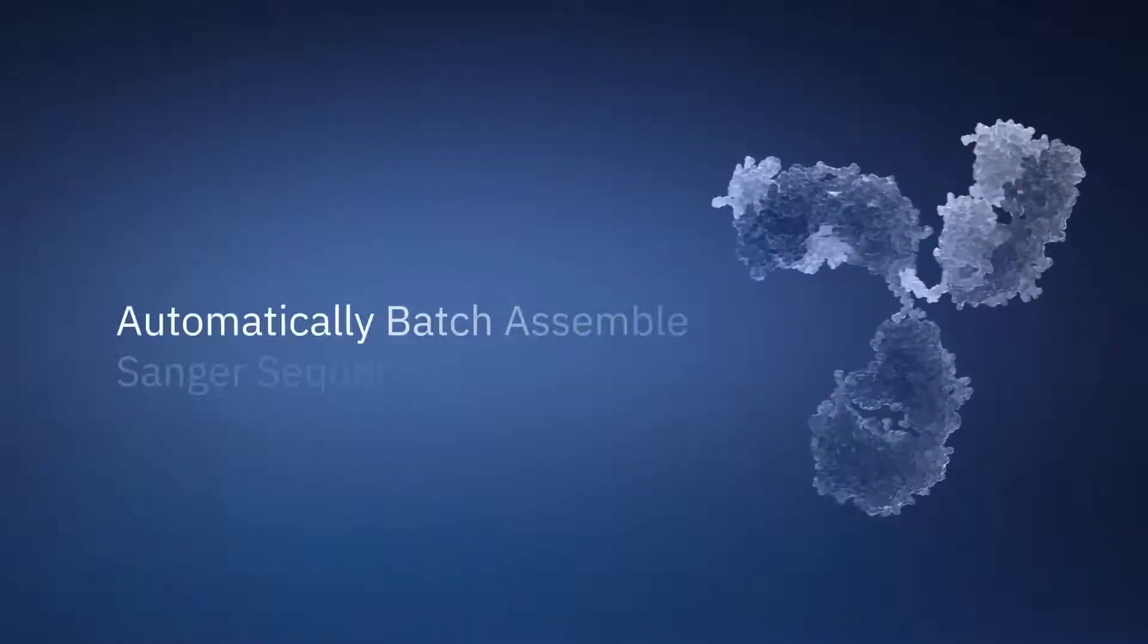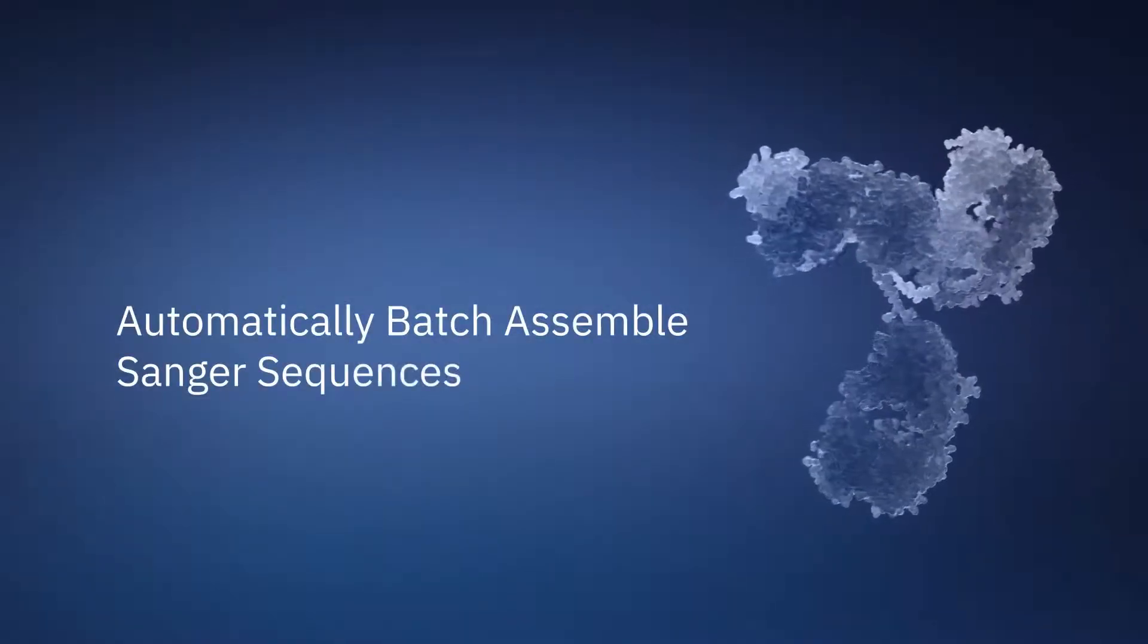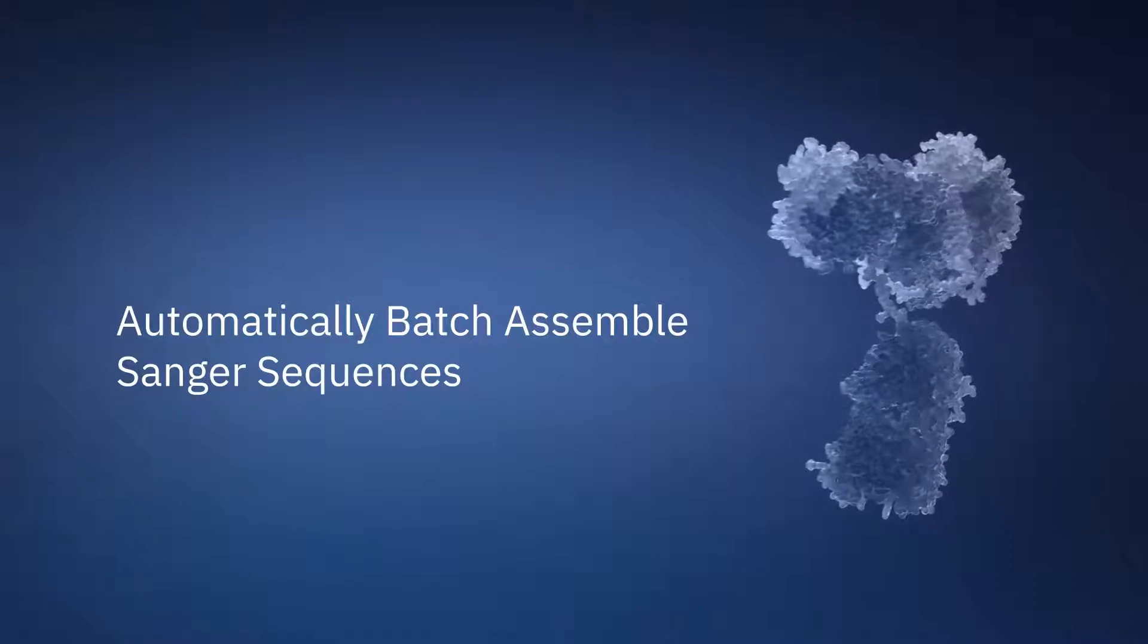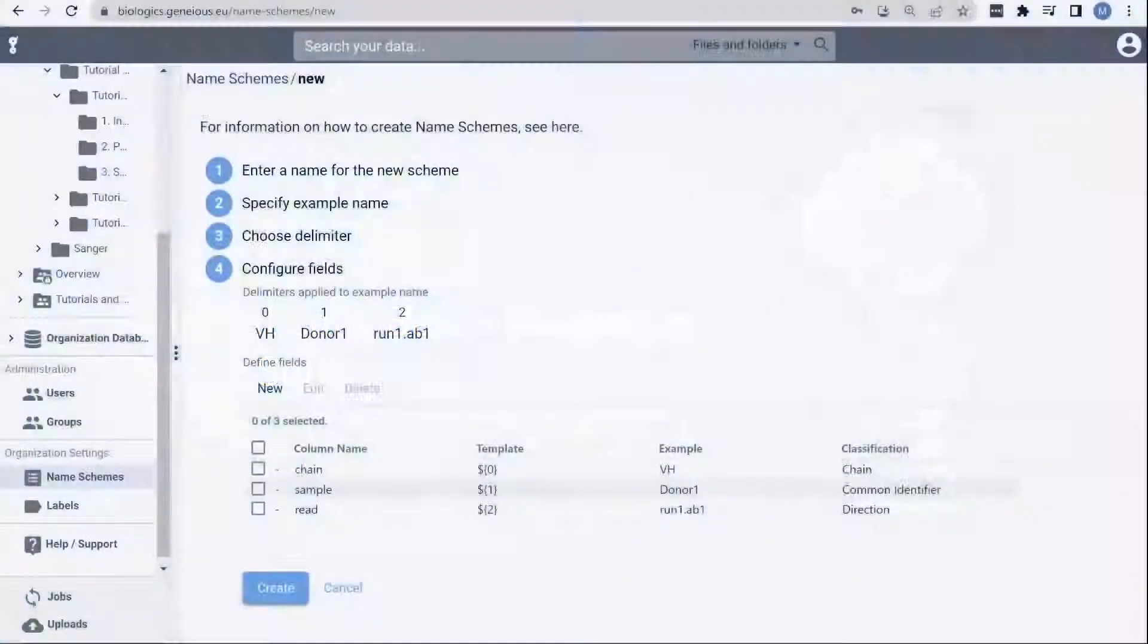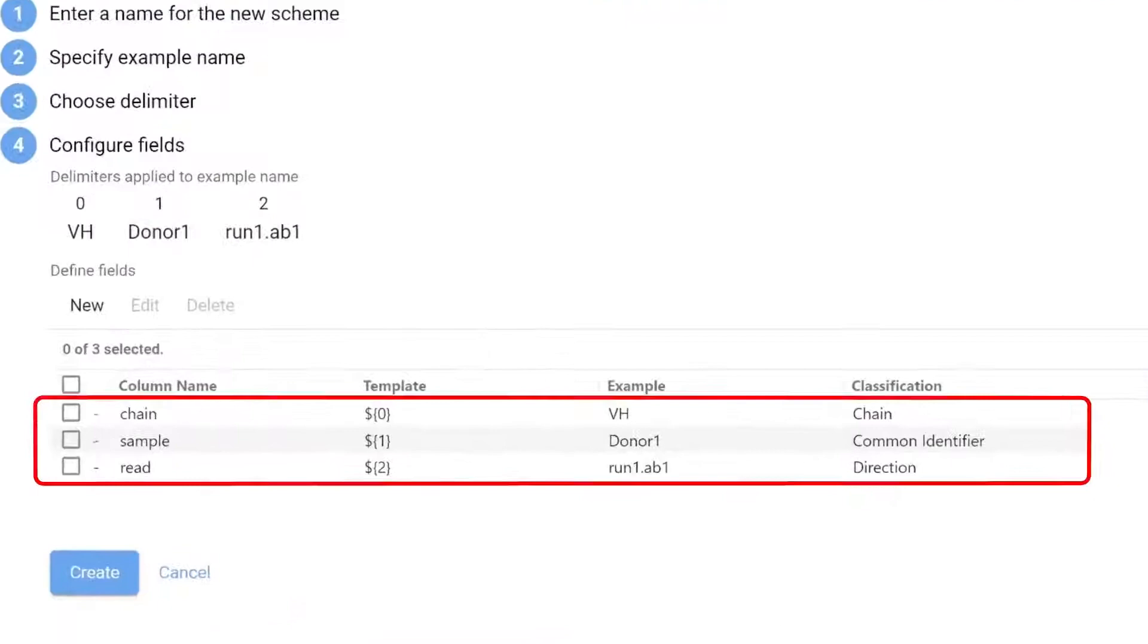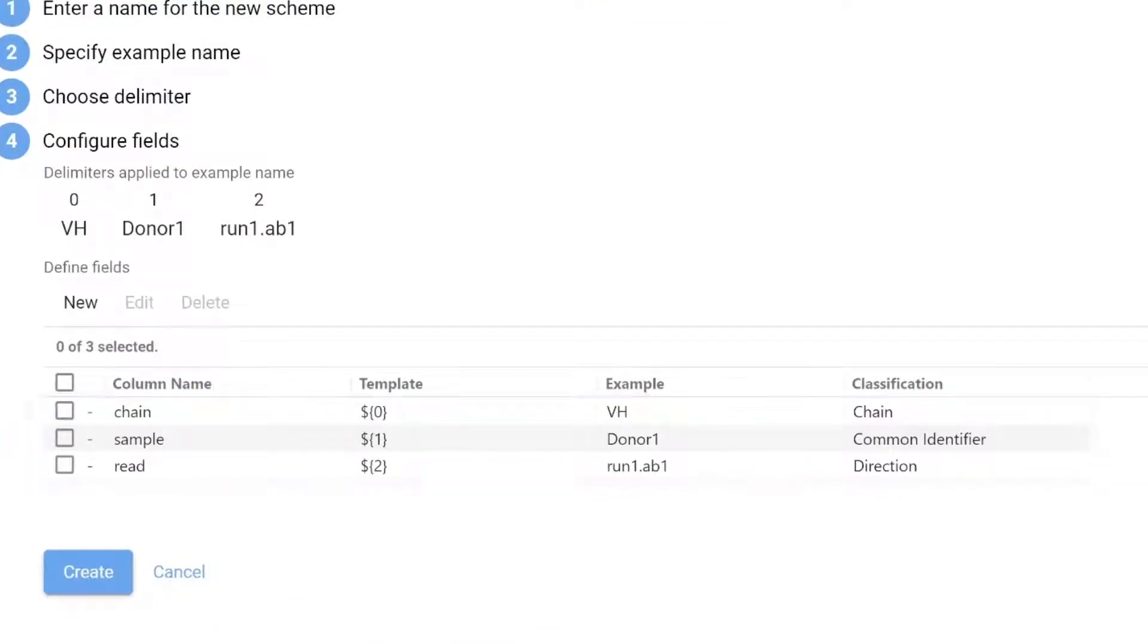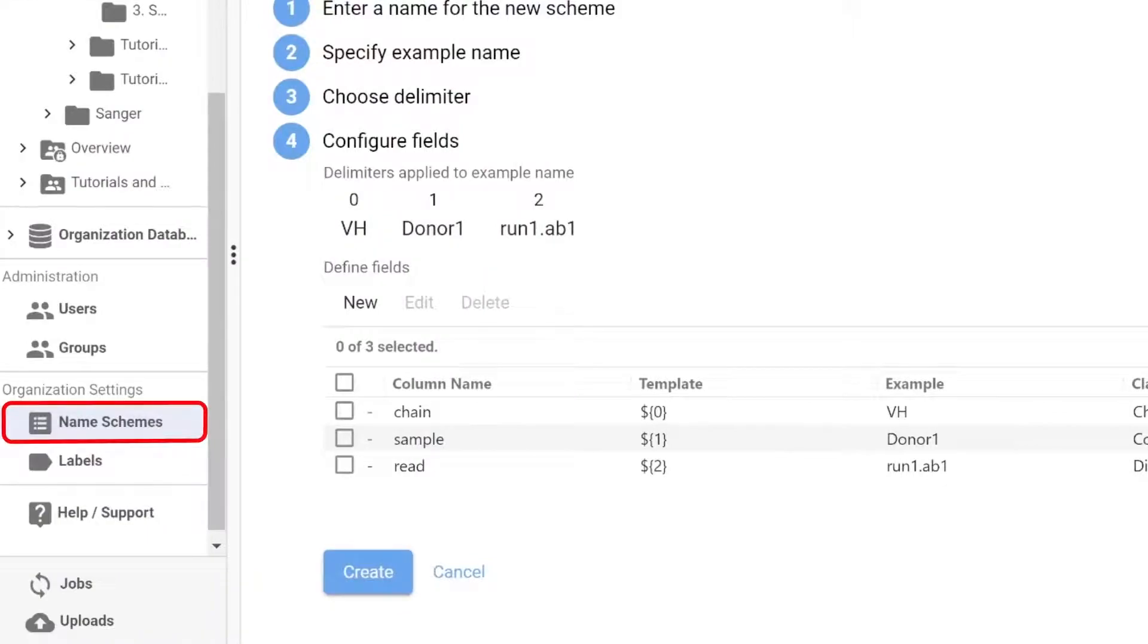Genius Biologics also features a tool to automatically batch assemble Sanger sequences using name schemes. You can see here that Genius Biologics is able to parse metadata like chain type, sample information, and read direction from sequence file names using the name schemes feature.